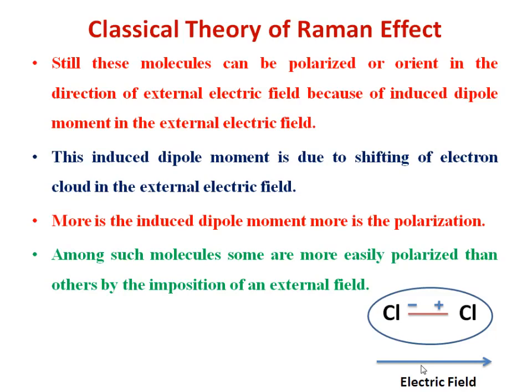This induced dipole moment is due to the shifting of the electron cloud of a molecule in the external electric field. The greater the induced dipole moment, the greater the polarization. Among such molecules, some are more easily polarized than others due to inherent properties of the molecule.